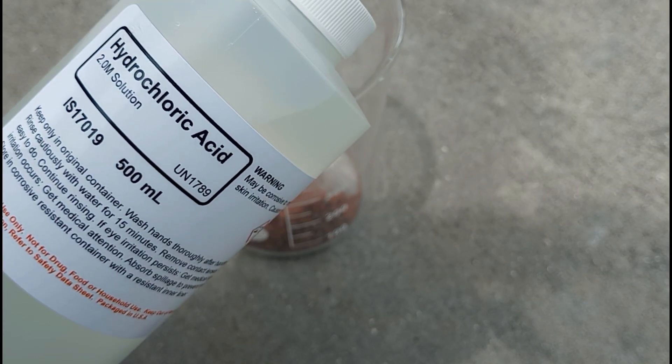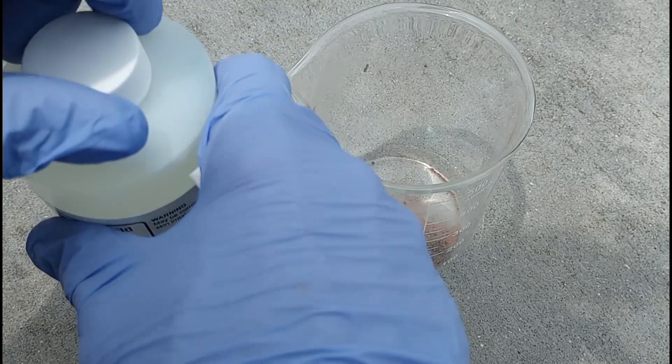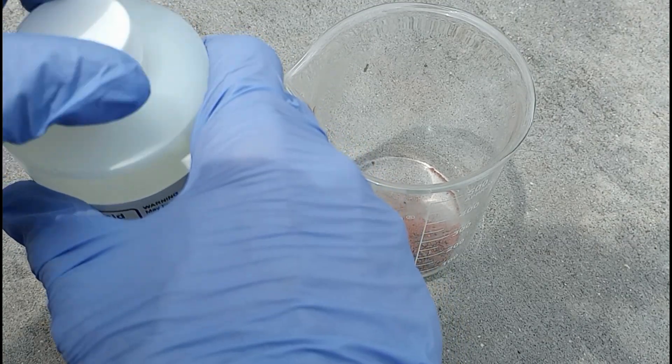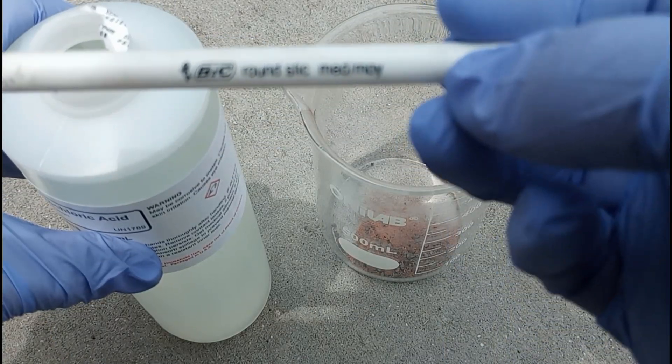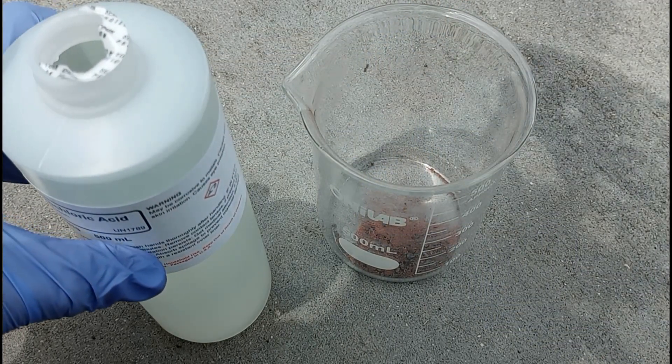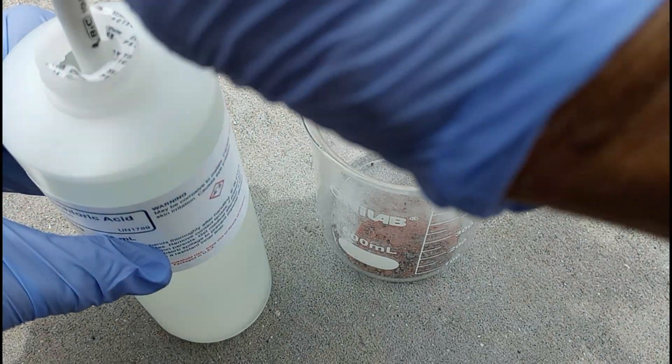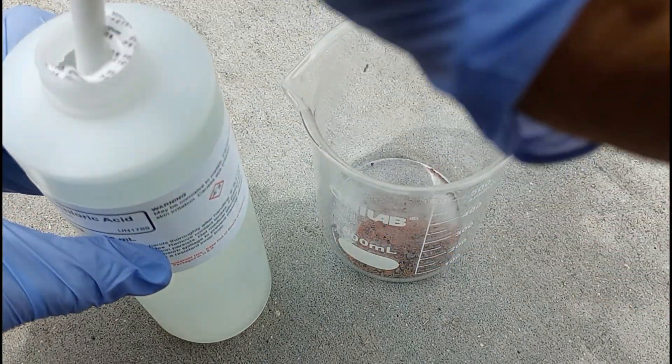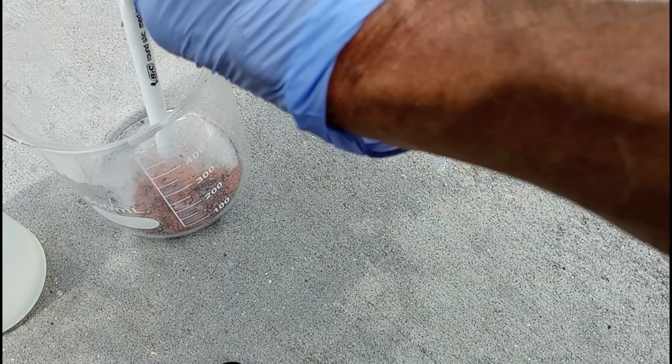We put all the copper substance into a beaker, and we have here a 2 molar solution of technical grade hydrochloric acid. We'll start with just a little bit at a time to see if we get any type of reaction. If it is pure copper, it should not react at all with hydrochloric acid alone. If it's zinc oxide or a copper oxide, it will dissolve in the hydrochloric acid.